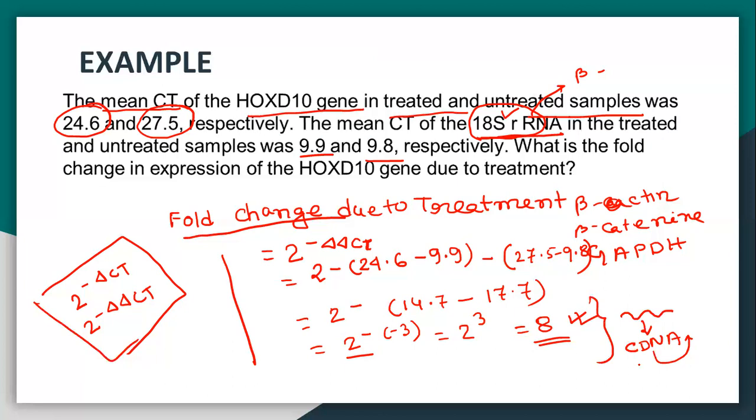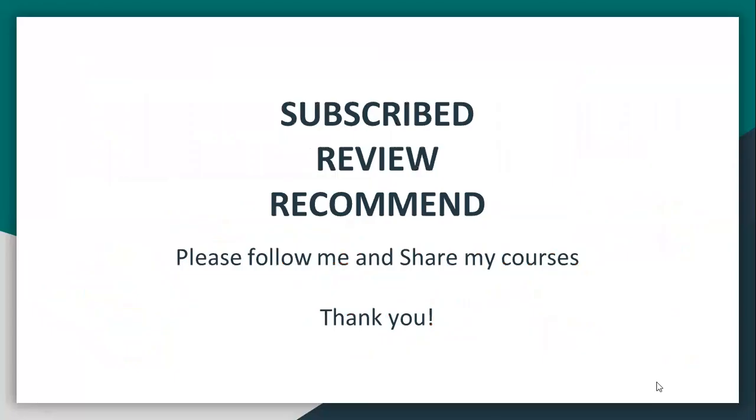In the case of coronavirus, specific primers are based on the gene. So these are important techniques for analysis of gene expression. Real-time PCR is important, and it is also very good for visualization of the data simultaneously.